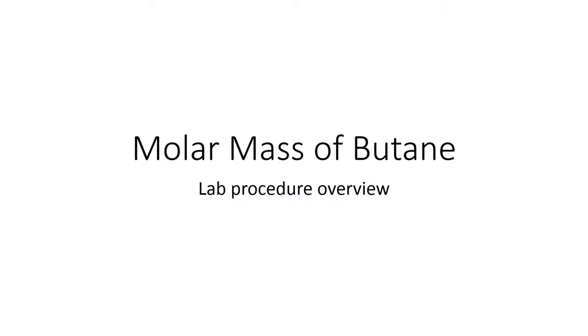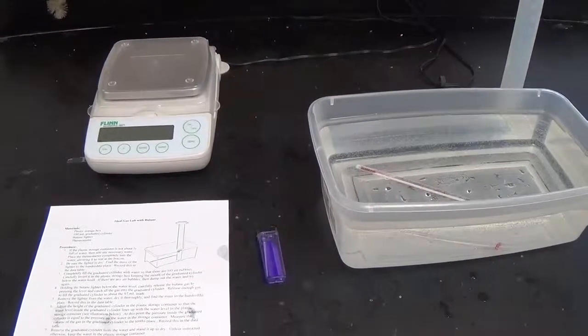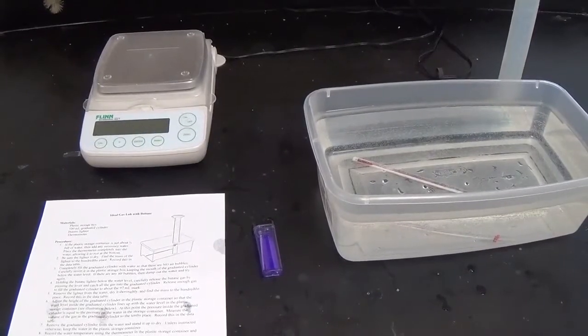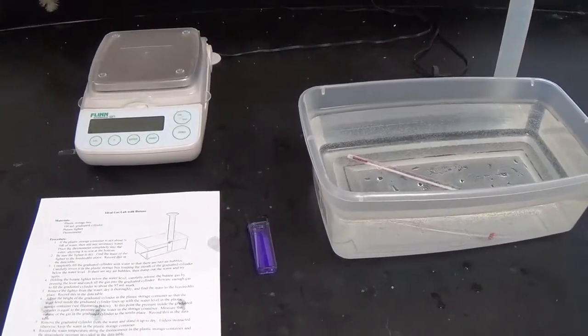Welcome. In the following video, we're going to look at the lab procedure for the molar mass of butane lab. You have a lighter, a tub full of water, a thermometer, a graduated cylinder, and an electronic balance.